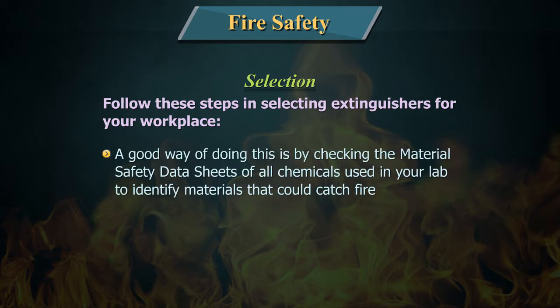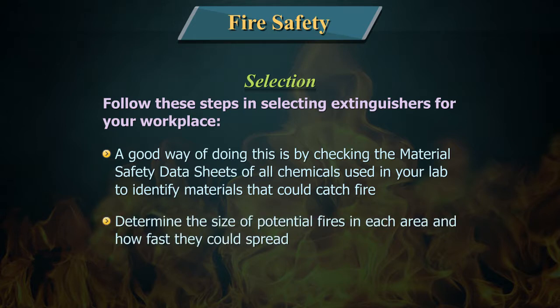A good way of doing this is by checking the material safety data sheets of all chemicals used in your lab to identify materials that could catch fire. Determine the size of potential fires in each area and how fast they could spread.